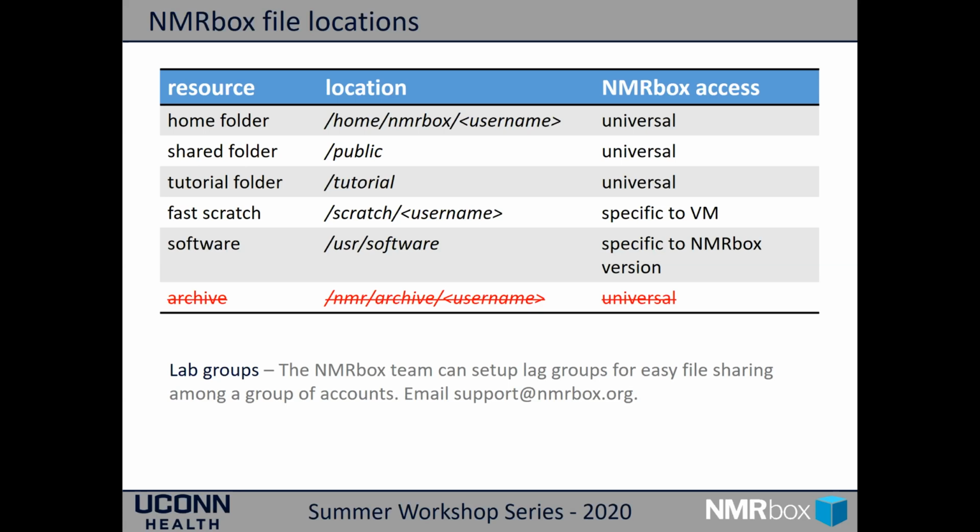But if you're doing some types of processing where you're reading and writing files very, very quickly, NMRpipe, which we'll be using later today, could be one of those programs that can be very I/O intensive. You can get dramatically improved performance if you copy your data to your scratch folder, process the data there, and then move it back to your home folder.